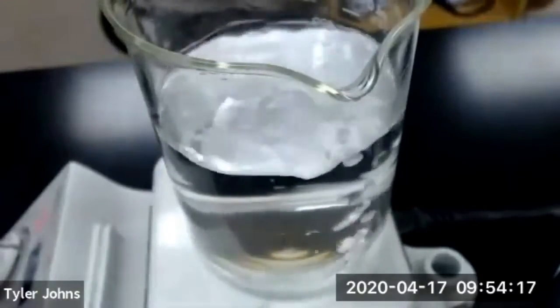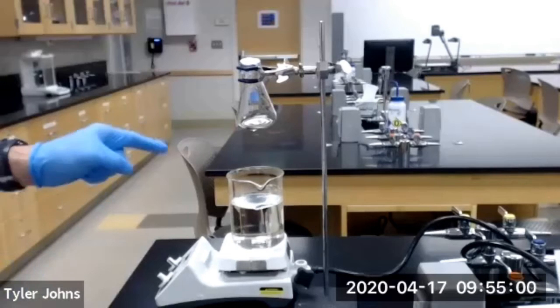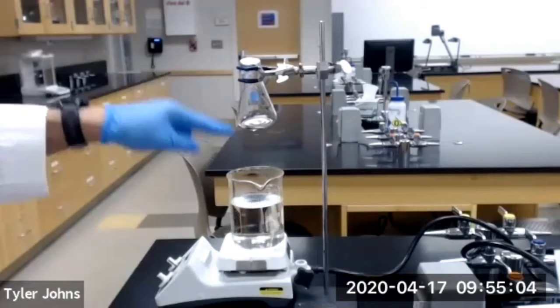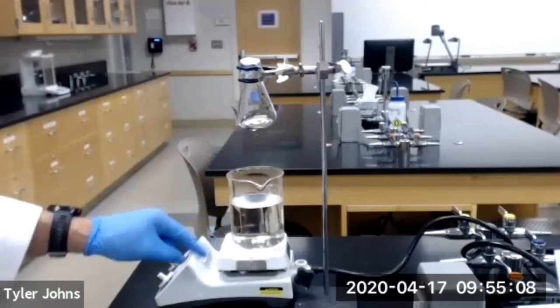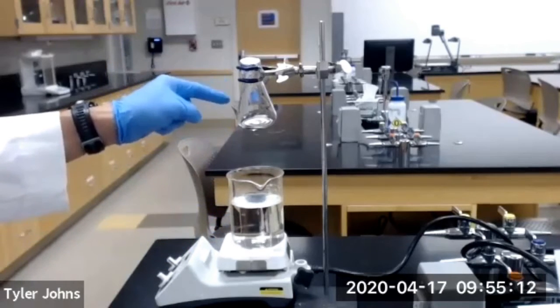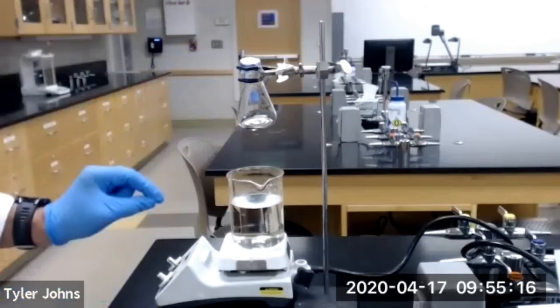We're going to allow it to cool. We've removed our 125 mL Erlenmeyer with the volatile liquid from the 600 mL beaker of boiling water. We're now going to allow this to cool and let the remaining volatile liquid condense back down into the 125 mL Erlenmeyer flask.